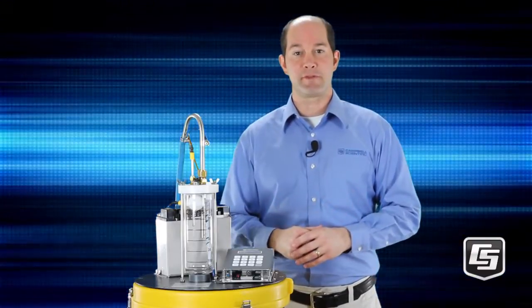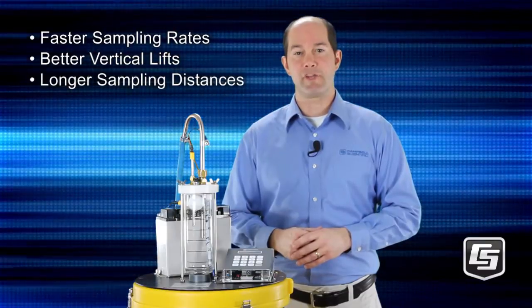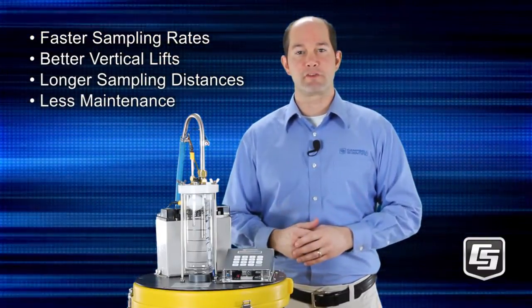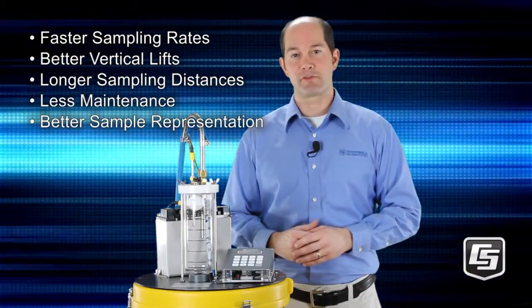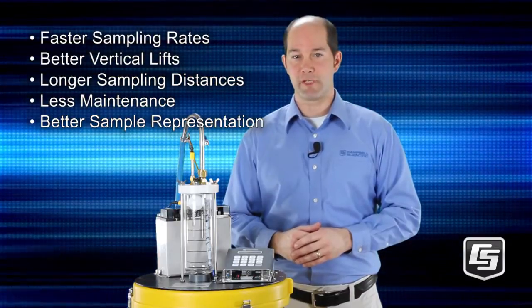The advantages of the vacuum pump method include faster sampling rates, better vertical lifts, longer sampling distances, and less maintenance. Because the vacuum method disturbs water less, it better represents the original water solution, especially if the solution has high concentrations of suspended solids.